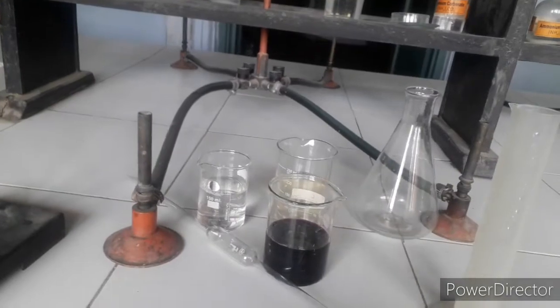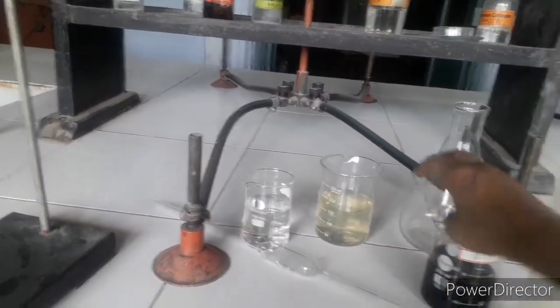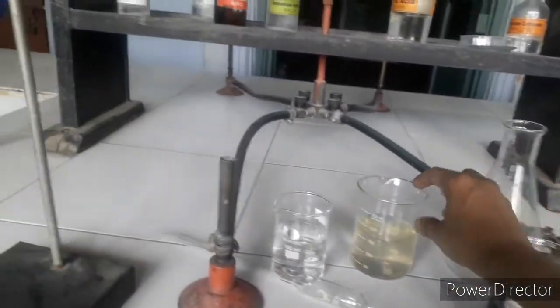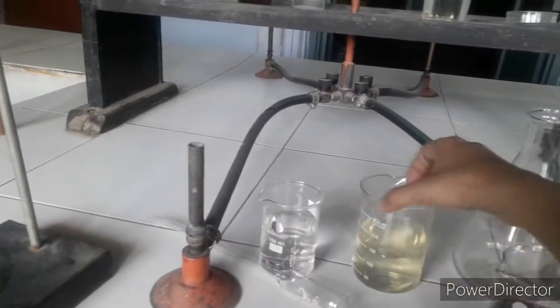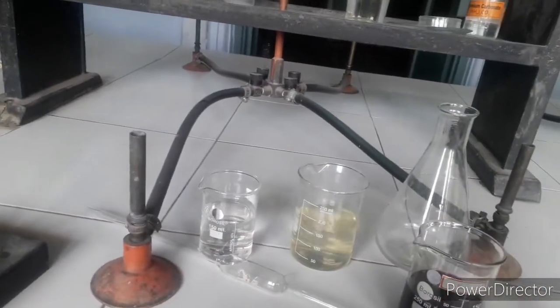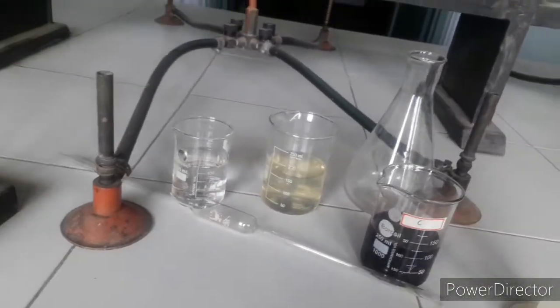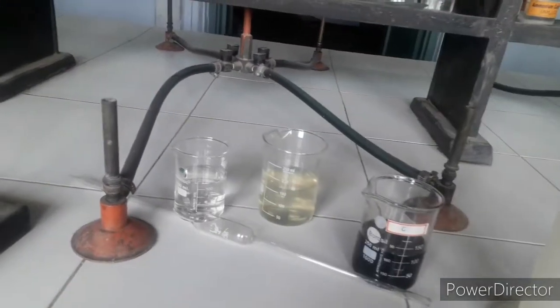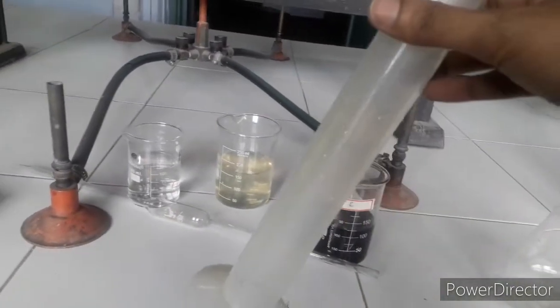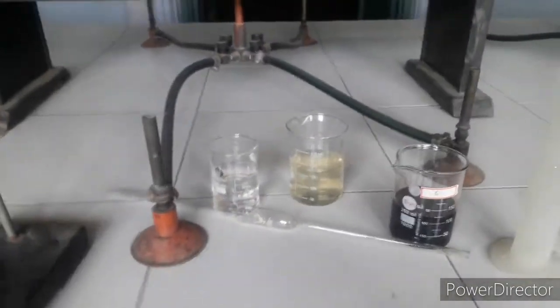I have already taken the solutions in separate beakers. This beaker has potassium permanganate solution — it is 250 ml capacity. This beaker has the ammonium iron(II) sulfate solution — hydrated. And this beaker contains dilute sulfuric acid. This measuring cylinder will be used to measure the dilute sulfuric acid.